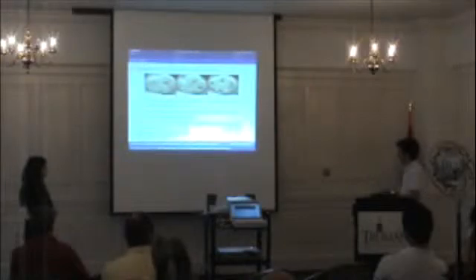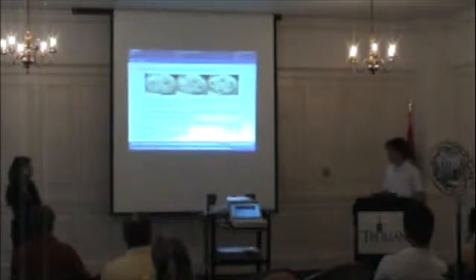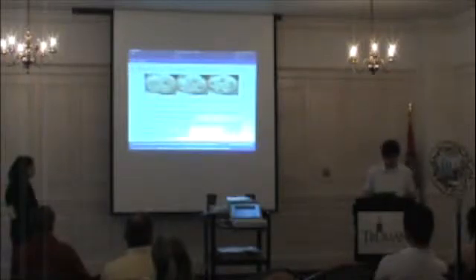So if we manage to make a model that gathers several data sets, we would be able to apply it across the entire species and look at changes within the wild type, so we can possibly apply it to mutants and see what changes are different and what forces are possibly affecting them in a different way.